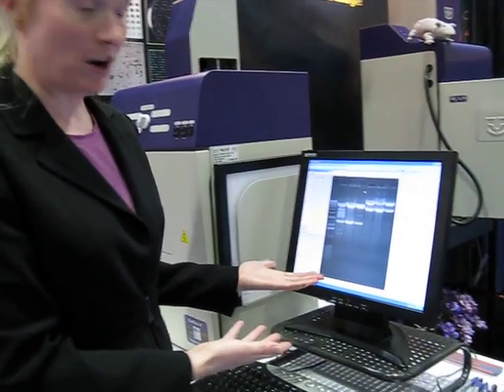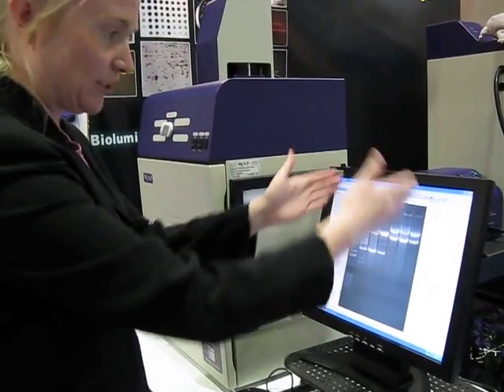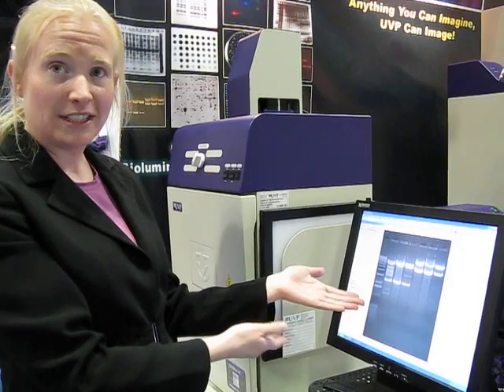Then you come over to the software part of it. You select preview just to square it up and see where it is. Then select capture, and after you select capture, you'll get a picture much like the one that you see on the screen here.